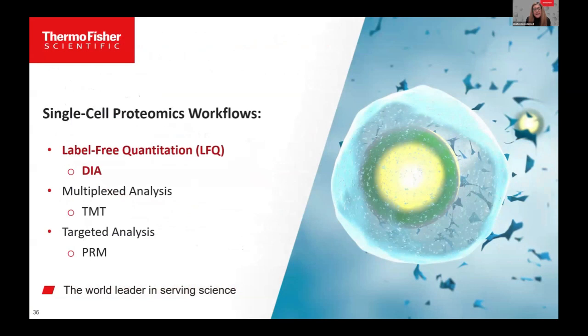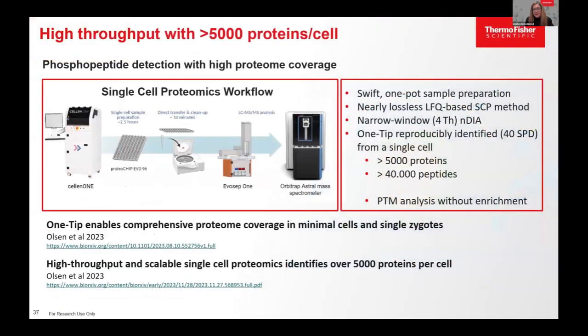And the next one, I don't have much time, but I just want to say you can do the same DIA performance and be quantitative at the single cell level. There are many ways to do single cells, and DIA is one. Thermo is promoting the Cellenion for cell sorting and digestion.